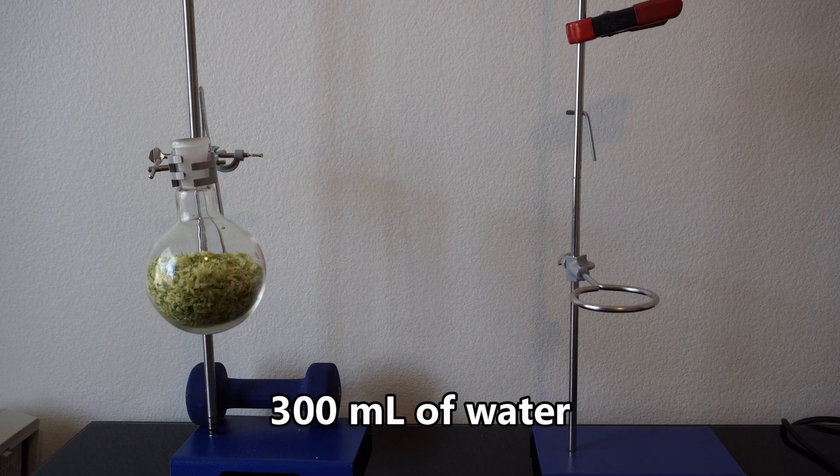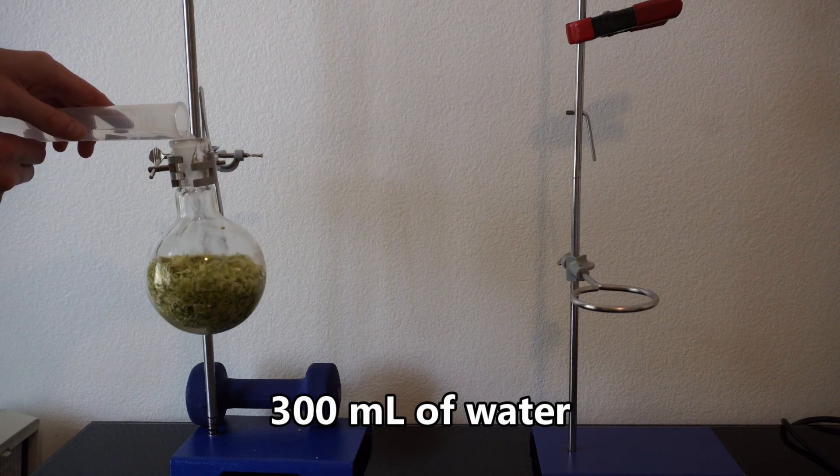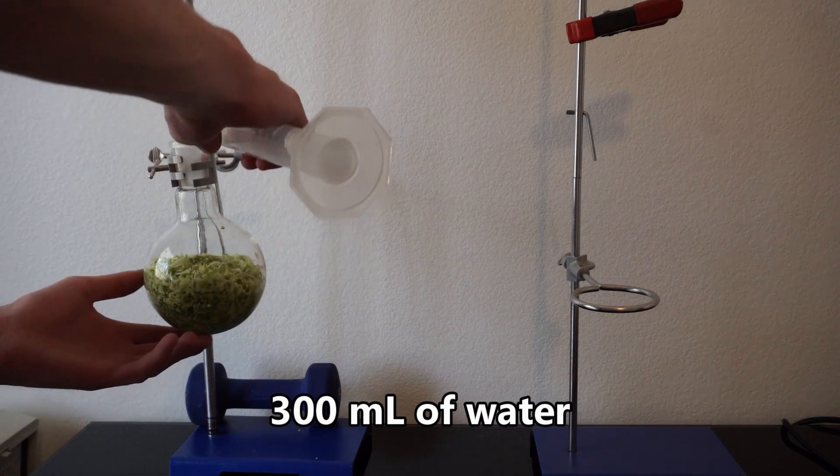I then add about 300 milliliters of distilled water before filling the condenser, placing my receiving flask, and turning on my heating mantle.